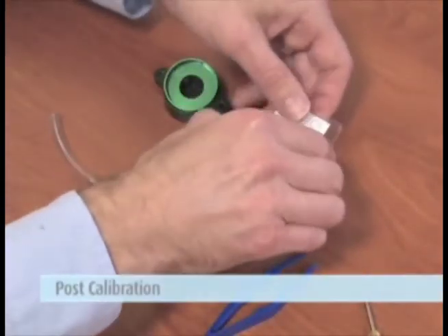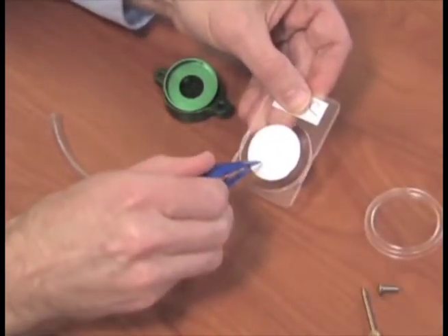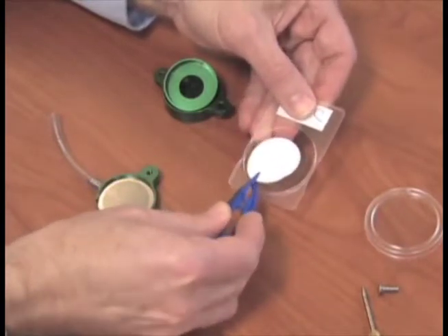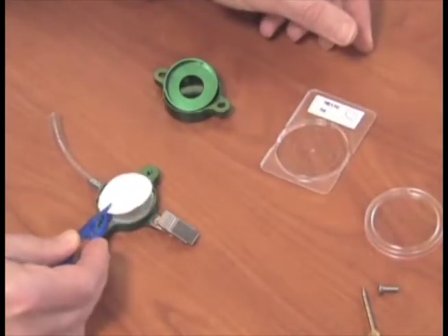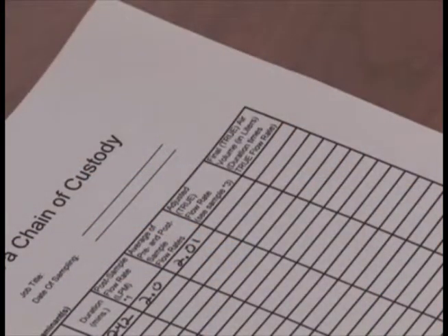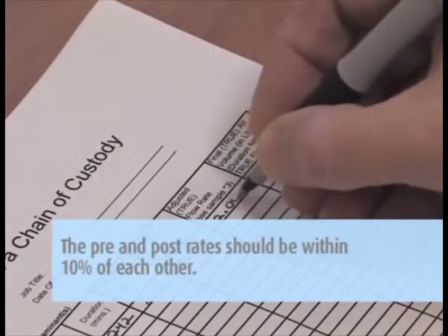After sampling is completed, a post calibration must be performed on the pump. Perform the post calibration the same way you did the pre-calibration using the marked calibration filter installed in the PEM, but do not make any set screw adjustments. Just record the flow rate on the pump calibration sheet. The pre- and post-rates should be within 10% of each other.